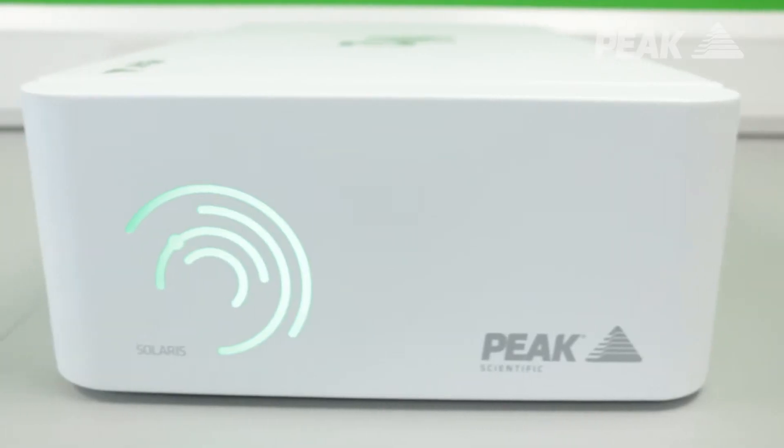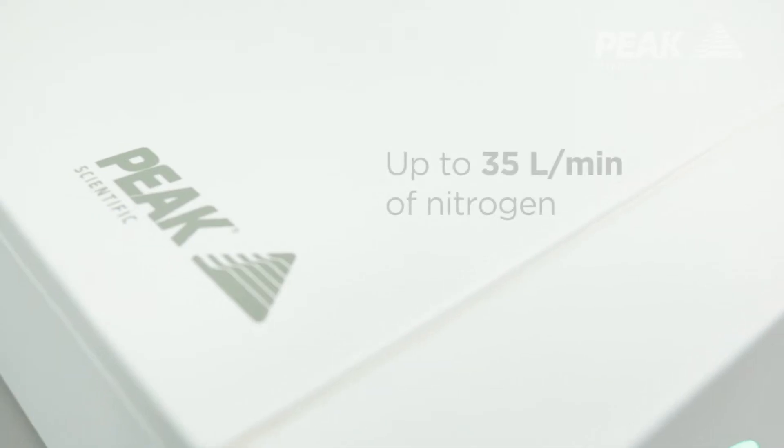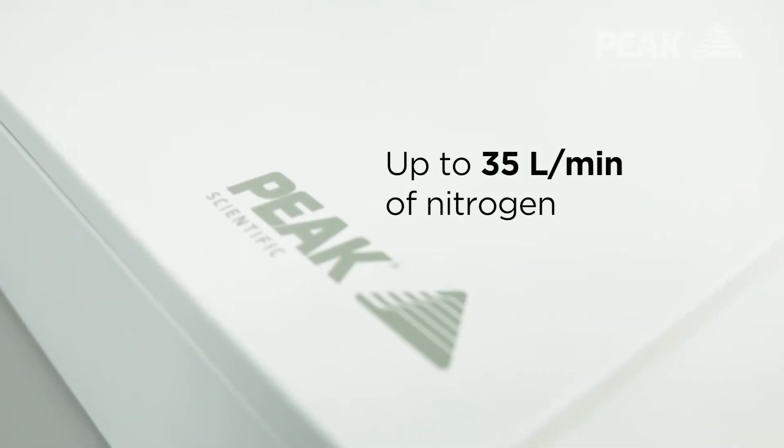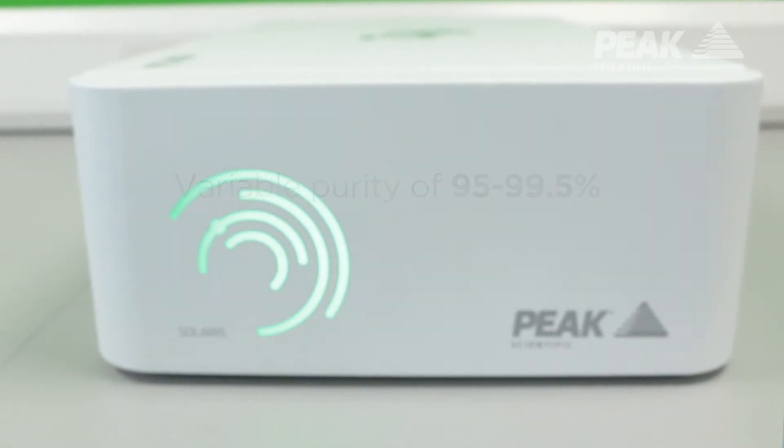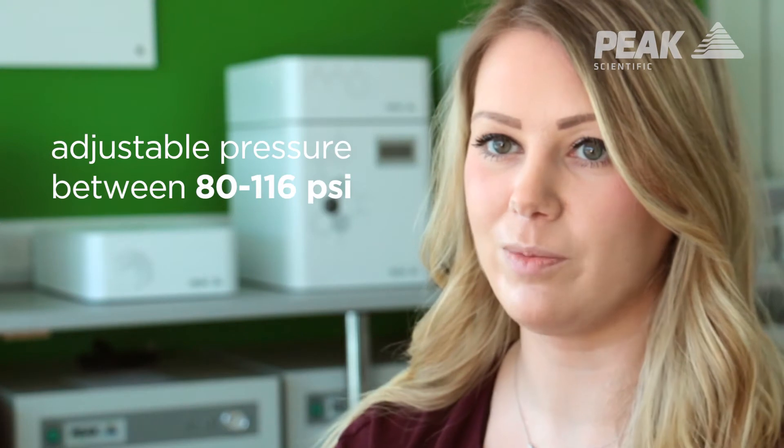I'm Lynne Keating and I'm a product manager at Peak Scientific. Solaris XE is a new nitrogen generator — a compressible nitrogen solution for laboratories. It can achieve up to 35 litres a minute of nitrogen, with variable purity between 95 and 99.5%, and the pressure is user adjustable between 80 and 116 psi.